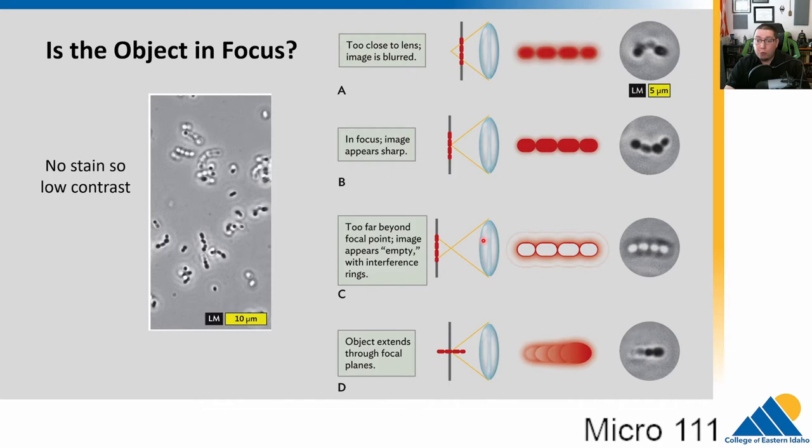The same problem occurs if we go too far — objects look transparent or hollow because the focal point is too high. Also, bacteria don't always lay flat on the slide. If a chain of bacteria is oriented at an angle, part of it will be out of focus above and below the focal point. The images I show in lecture slides look much better than what you'll see in lab because they're cherry-picked — the best of the best. Don't despair if you have trouble getting perfect images.